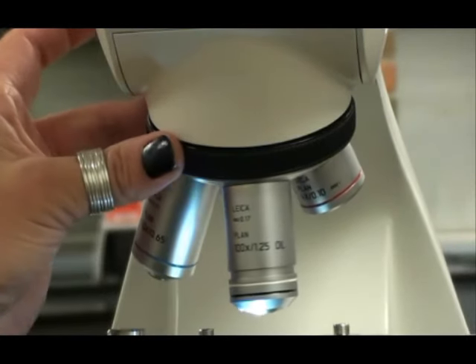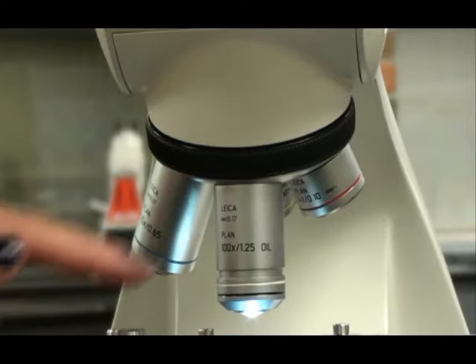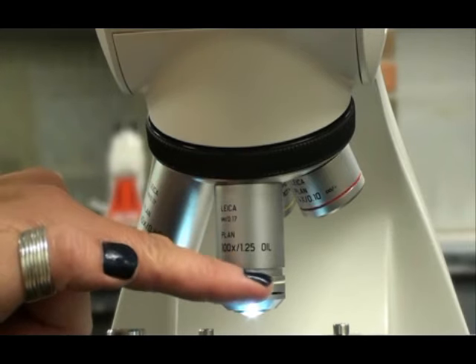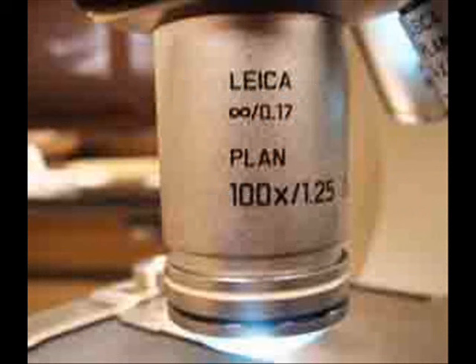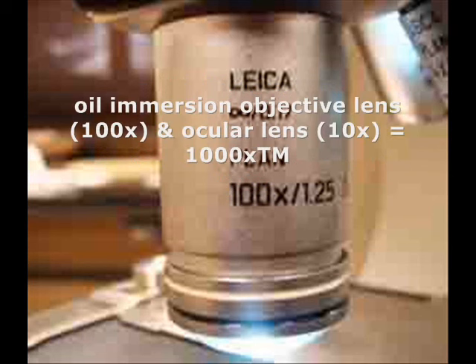Compound microscopes typically have three or four objective lenses. If you do have a fourth lens, that would be the oil immersion lens. It has a black and white band around it. It magnifies objects 100 times actual size. So together with that ocular lens of 10 times magnification, I can get a total magnification with oil immersion of 1000.